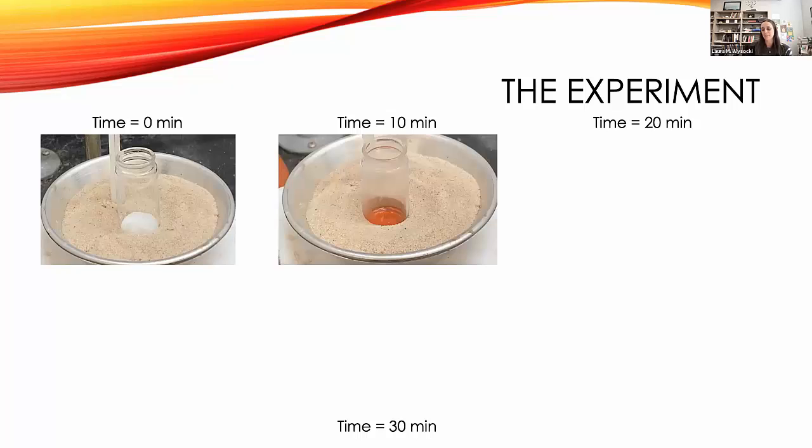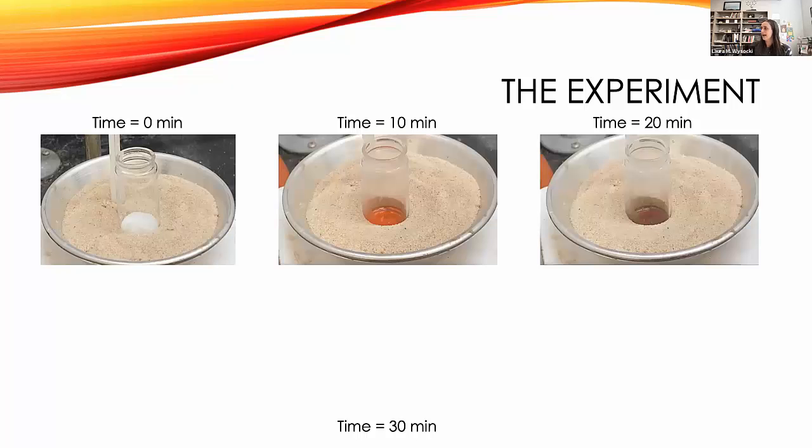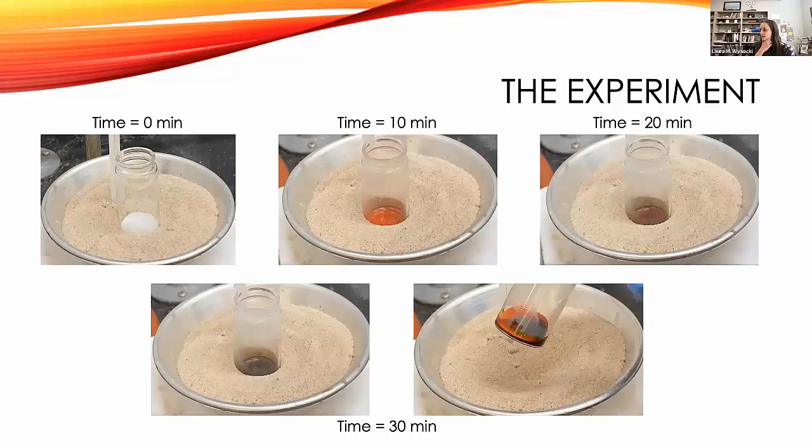So, students are starting to get excited. And at 20 minutes, it's getting more intense. And after 30 minutes, we actually stop the reaction. You can see the color is relatively intense. And the other image I show here just shows the consistency. So it is a liquid at this point. And then when it cools down, it gets kind of like a sludge. So a little different than the starting material.